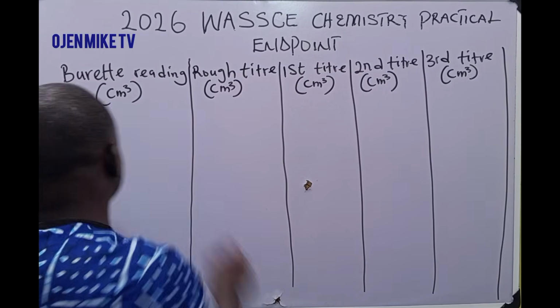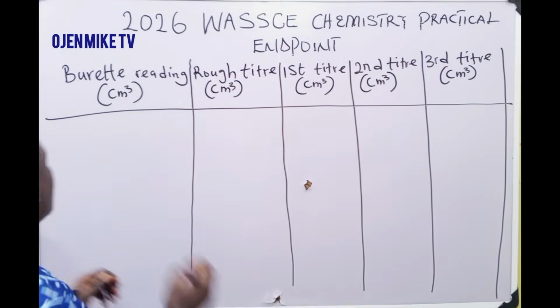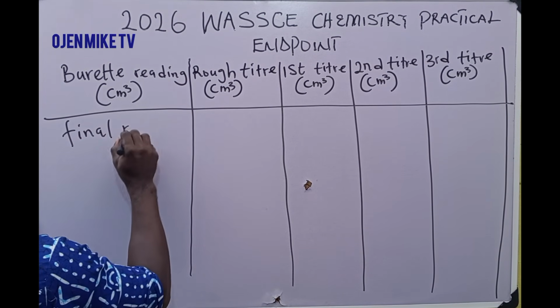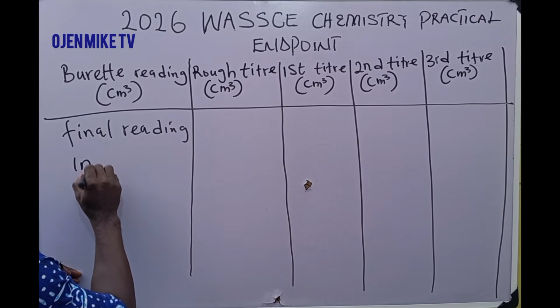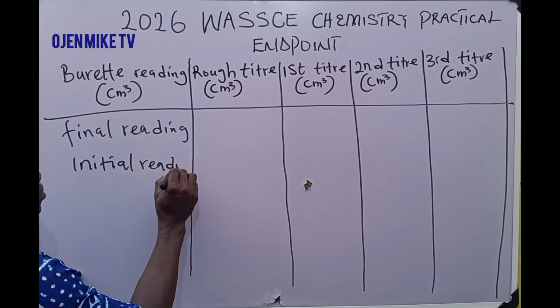So the next thing you are going to look at is your final reading. After your final reading, we have initial reading.